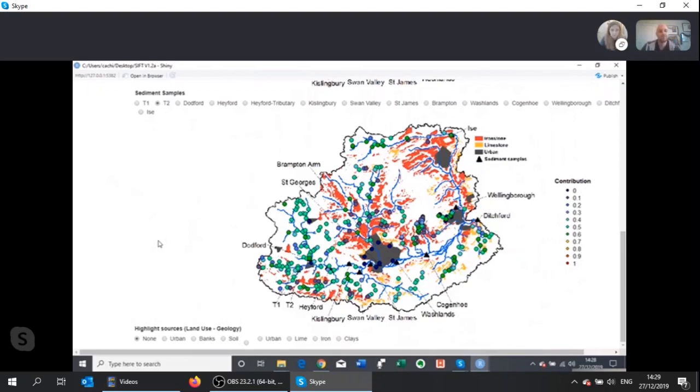And it will take all the sediment provenance estimates from all of those sources and average them together, and it comes up with the average contribution of that particular sample and its groups to the sediment, which means scientifically it's perhaps not the best way of doing it. But to come up with an end result for this software which shows you the sediment provenance results, it comes up with this, which is almost like a heat map of where sediments are most likely to have originated from. Yeah, that's really useful if you wanted to show farmers or anyone this data. I think that's a really visual way of showing that to them.